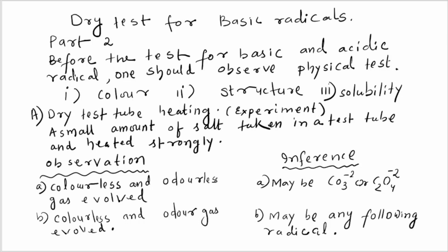One is amorphous, the other one is crystalline. Generally, most salts are crystalline. And solubility means whether the salt is soluble in water or not. Here, soluble salt is given, that means in the syllabus.